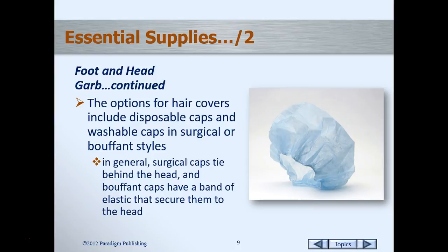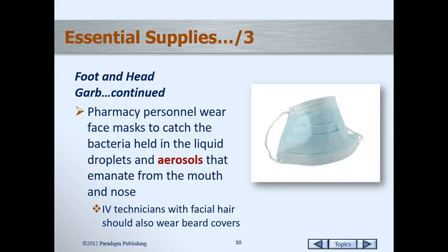Generally, if you think of them like lunchroom lady caps, kind of thing, to cover our hair. Now, depending on your hairstyle, you may need more than one cap to encompass all of your hair. After you put on your cap, we're going to sanitize our hands again, and then we're going to put on a mask. So the different kinds of masks may be one like the one pictured here, where it's got loops that will go over your ears, or you may need to tie it. If you're a man and you have facial hair, you may be required to wear a beard cover.